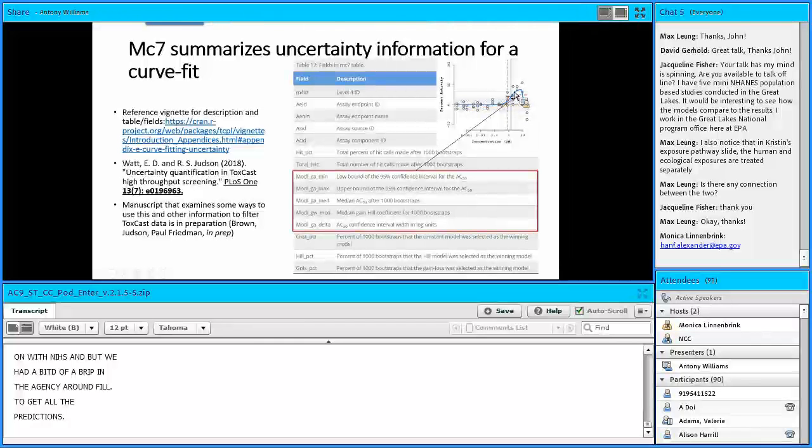And then we have this gray line across the top. That's our cutoff for a positive. And then this hashed gray area of the plot is essentially the noise. We're defining the noise by that band. And so on this plot, we can infer an AC50. So this blue vertical line is showing you where the AC50 for that curve fit would fall.